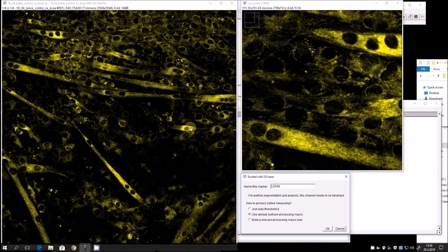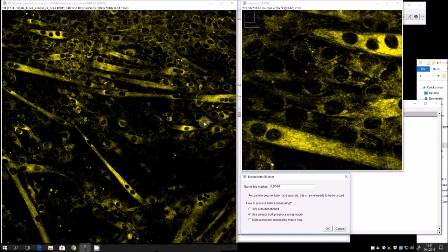Alternatively, you can build a new processing macro to figure out your own threshold for your own channel and purpose — I recommend doing this beforehand. You can even use more complex protocols such as deep learning with the WEKA tool, where you teach the machine to recognize different types of objects. For our purposes here, we are going to use this pre-built analysis macro.